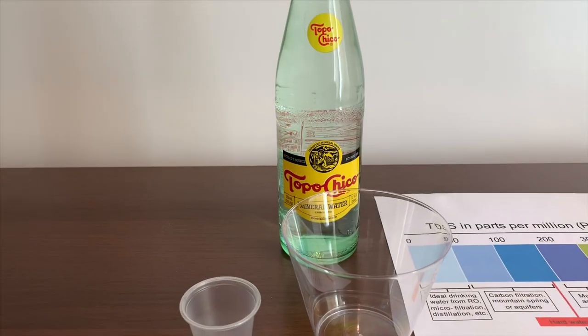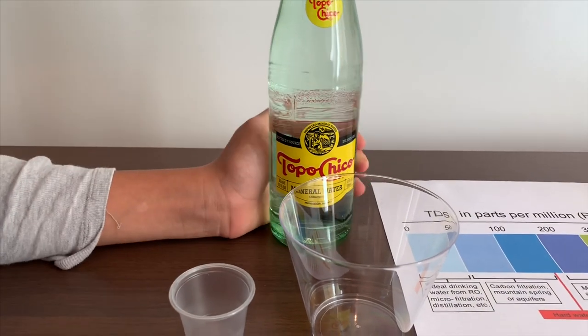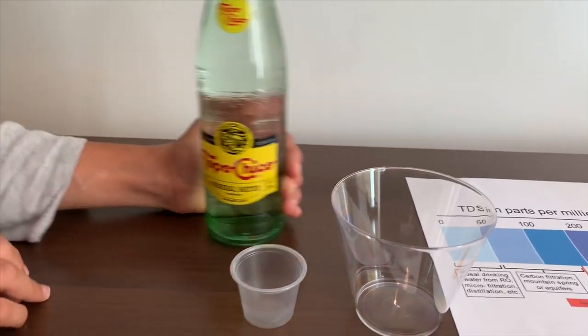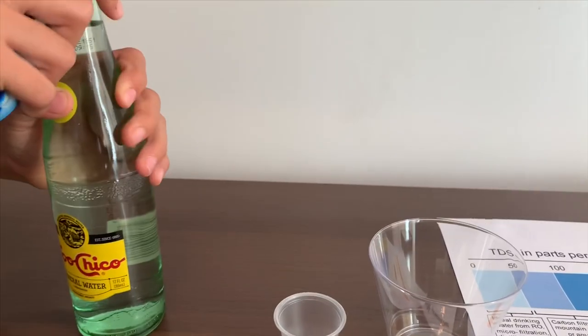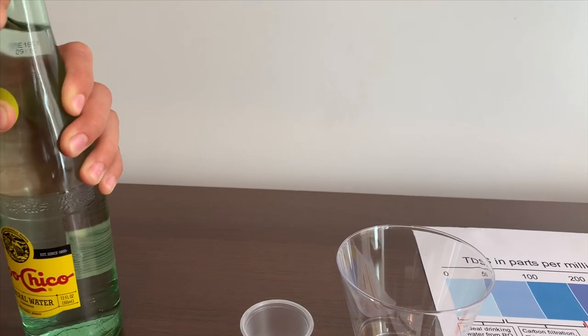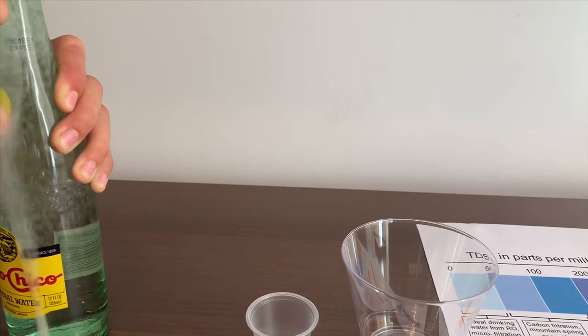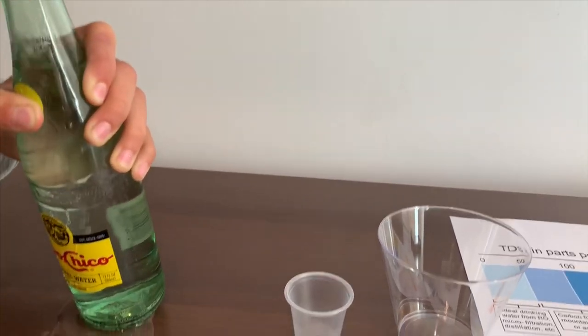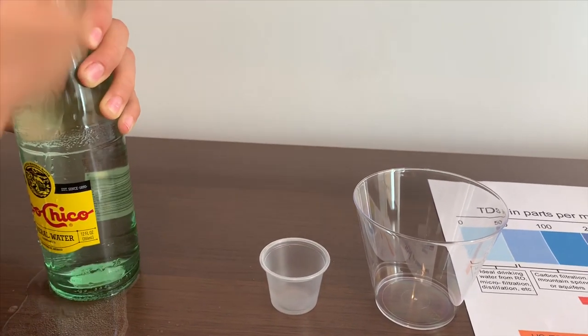This is Topo Chico mineral water and it's from Mexico. It costs $1.29. Let's open it so we can test the TDS level and pH level.